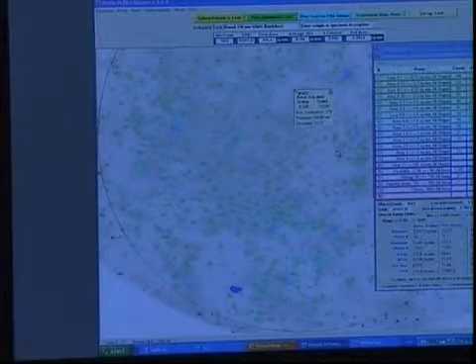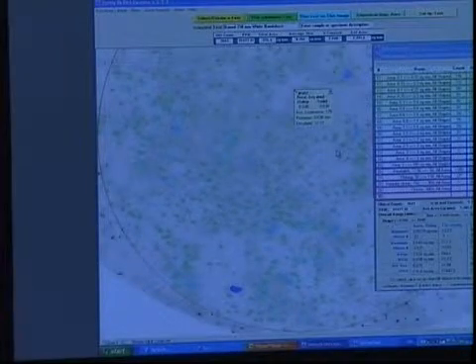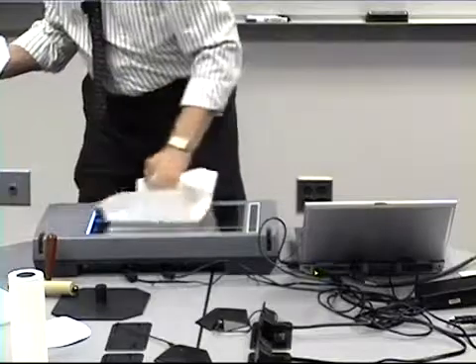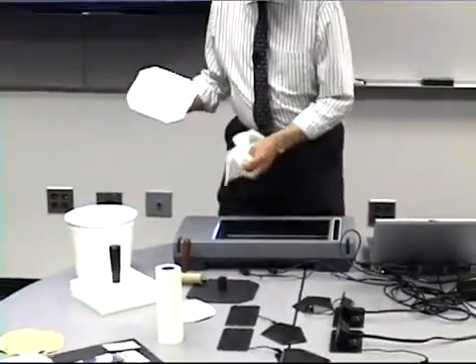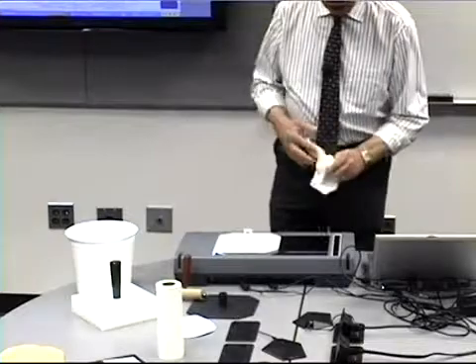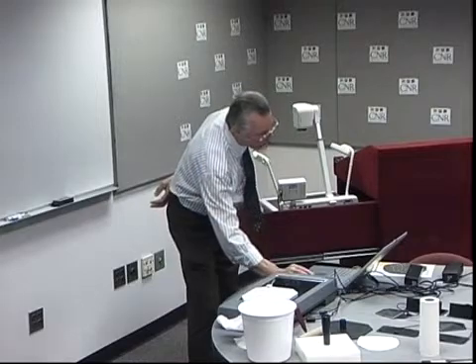Very quickly, a review. Imagine this is a blotter paper, and this is the wet hand sheet right off of the couch roll from the hand sheet mold. And we scanned it in, and we can very quickly diagnose the system. Now, as I mentioned, we're recording all of the steps in the process.